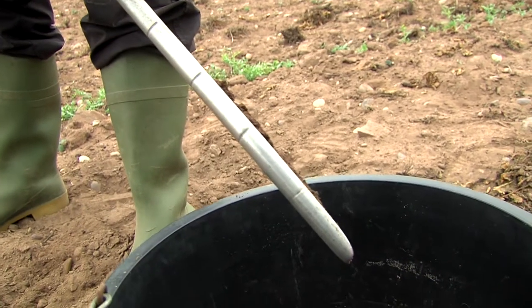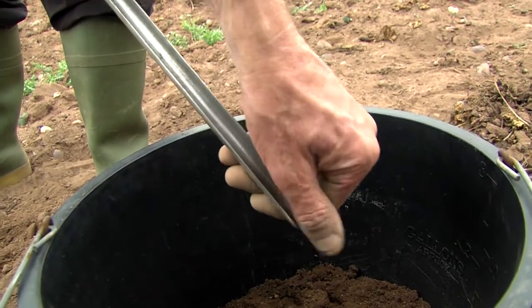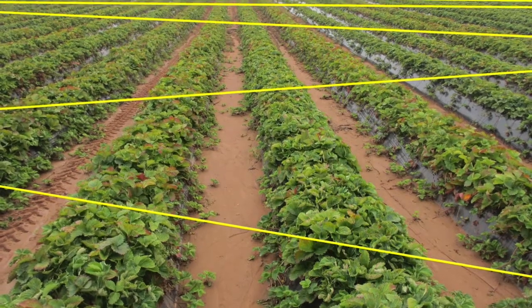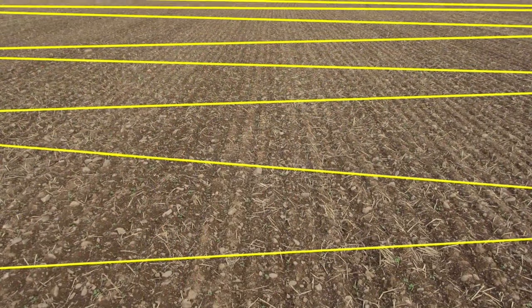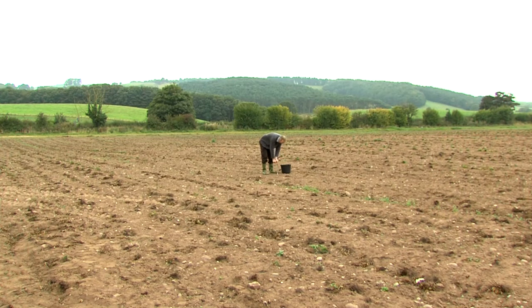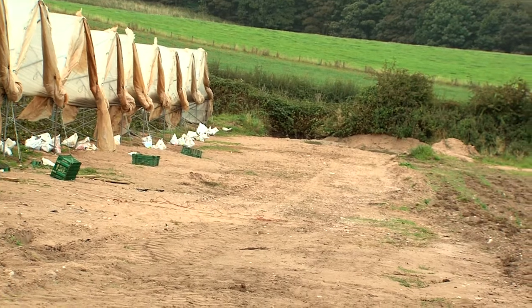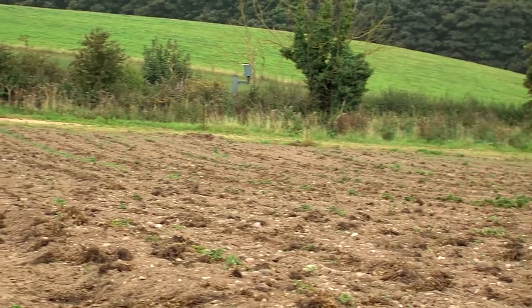Sampling depth for the core is typically 0–15cm and is related to cultivation depth where most of the root zone is found. Use an even zigzag or W pattern for sampling a field. Take as many soil cores as possible — a minimum of 25 soil cores should be taken per field, based on a 10-hectare field. Avoid taking a core around non-typical areas, for example gateways, tracks, and hedges.